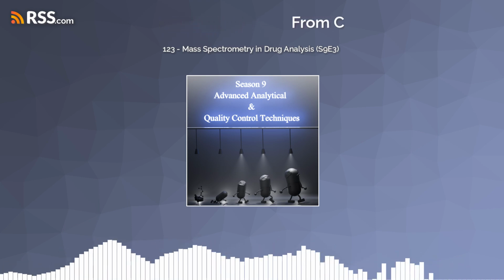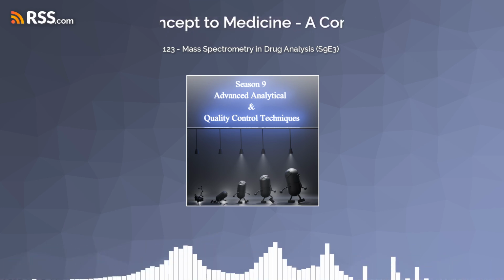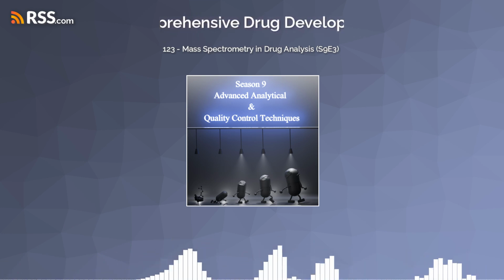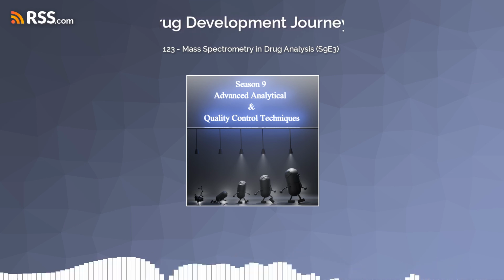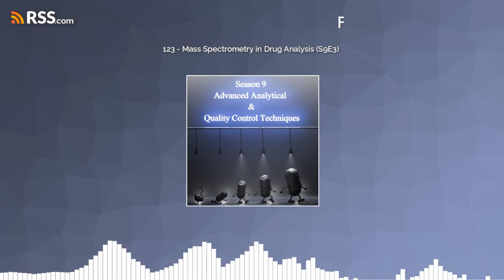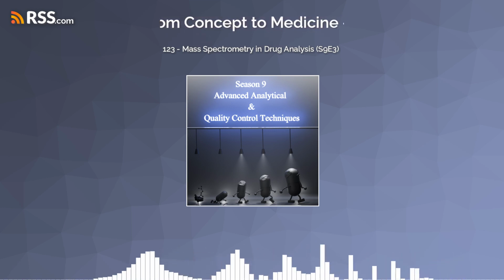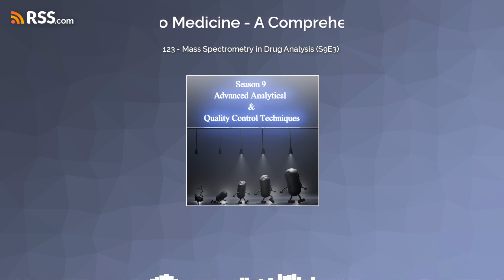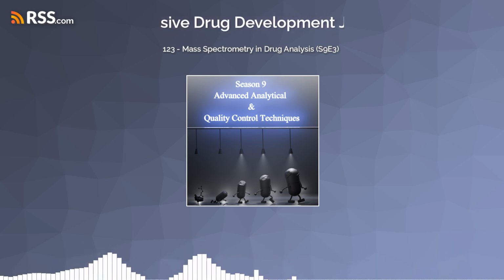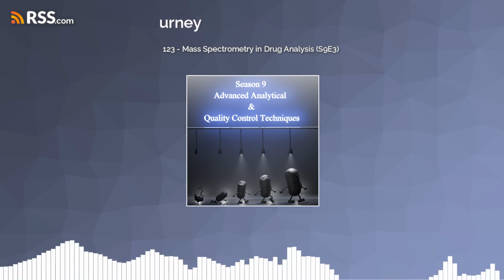You mentioned that there's more than one type of mass spectrometer. Why not just have one do-it-all machine? Well, the molecular world is vast, and we need to ask a lot of different questions about it. So different types of mass spectrometers have evolved to be specialists in their own right. So like some are better at analyzing huge complex molecules like proteins, while others are good at finding smaller organic compounds. Exactly. Some are all about measuring a molecule's mass with incredible accuracy, which is essential for figuring out its exact chemical makeup. So it's about using the right tool for the job, a bit like choosing between a microscope and a telescope, depending on what you want to see.